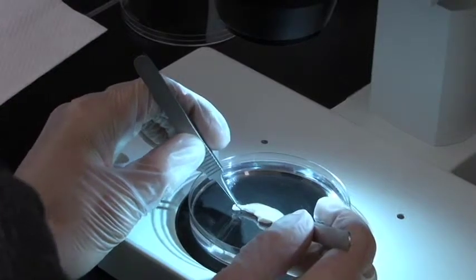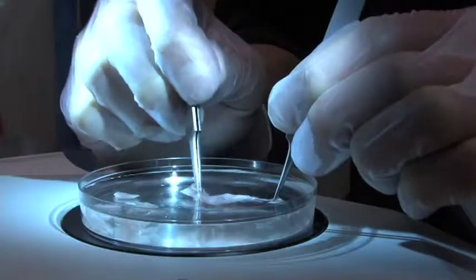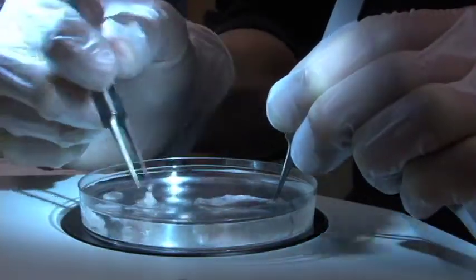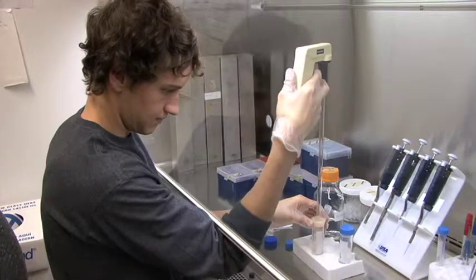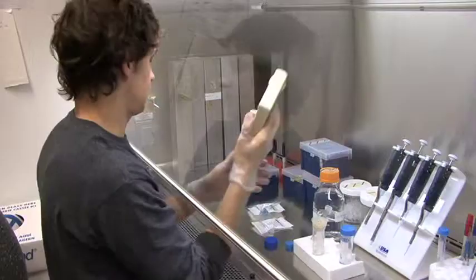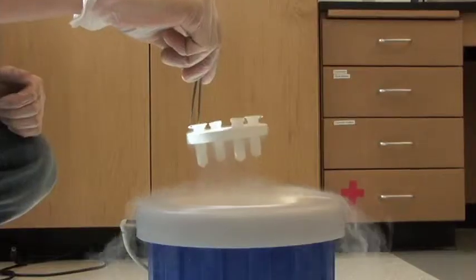To look at the natural factors that might make stem cells migrate, crushed muscle extract is made. Crushing muscle releases factors in response to the damage. The crushed muscle is filtered, and the remaining liquid contains the important motility factors. This extract is then divided and flash frozen in liquid nitrogen.